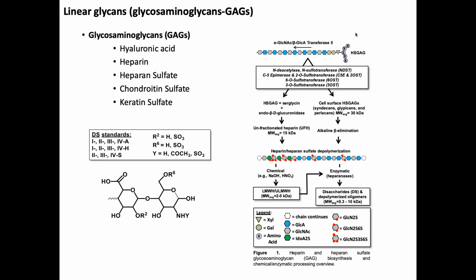So the family is smaller, or at least known, but I see papers from time to time on the discovery of a new proteoglycan. My guess is these will continue to be expanded as you start looking at lower abundance proteins that come in through the mass spec to find these different modifications.